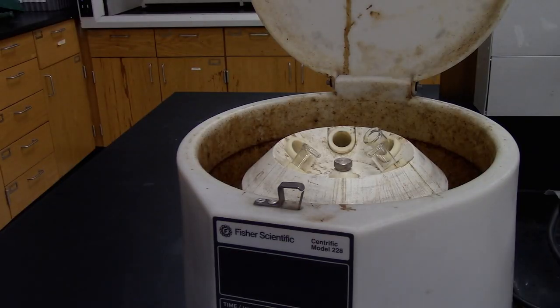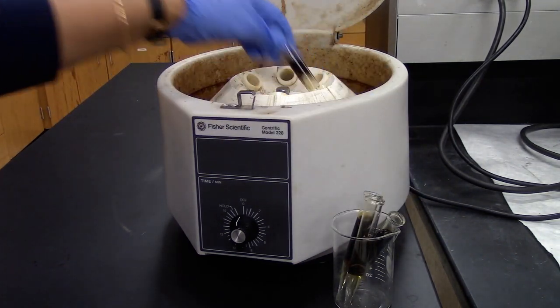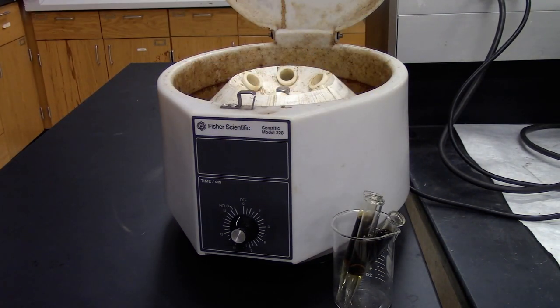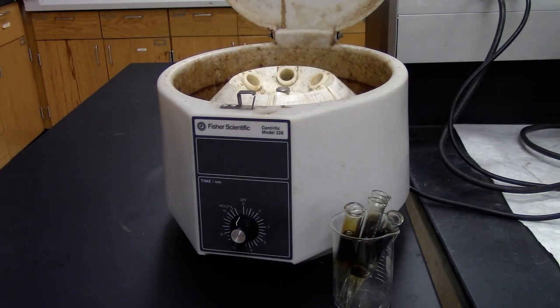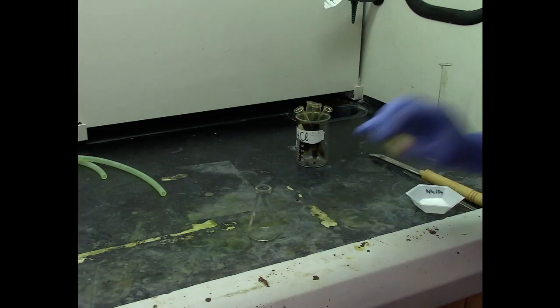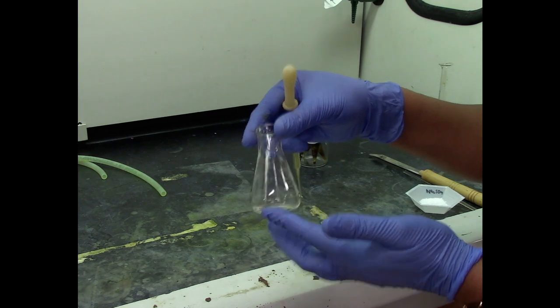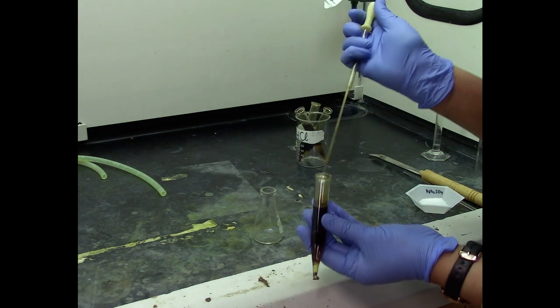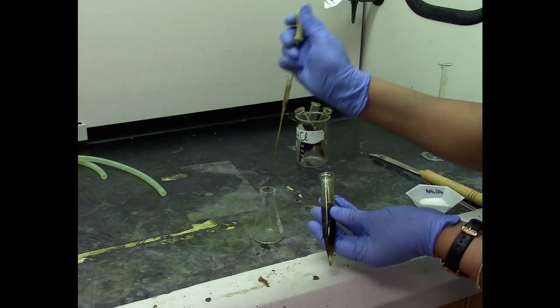Once done, the centrifuge tubes will have two layers. The bottom layer with the DCM and caffeine and the top layer is the aqueous layer. Using a long tip glass pipette, transfer the bottom layer of each of these centrifuge tubes into an Erlenmeyer flask.